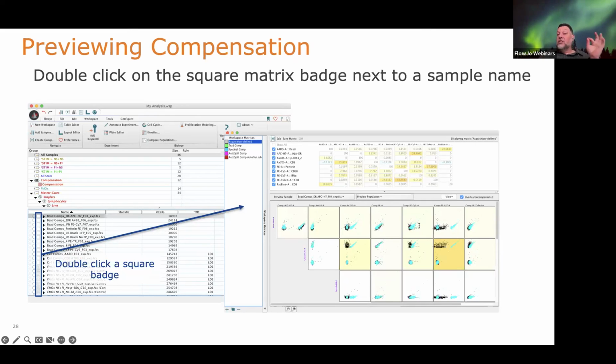Tough question here. The question now is the focus on a panel involving both lymphocyte and myeloid cells with some sharing markers, should two unmixing compensation matrices be used when analyzing either lymph or myeloid subpopulation? In a perfect world, I would say yes. And I know that's not a fair thing to ask everybody to do, right? So what you absolutely have to do is gate the right population and get the right population for your markers, right? CD14 is on monocytes, it's not on lymphocytes. You get the monocyte region and get a signal.